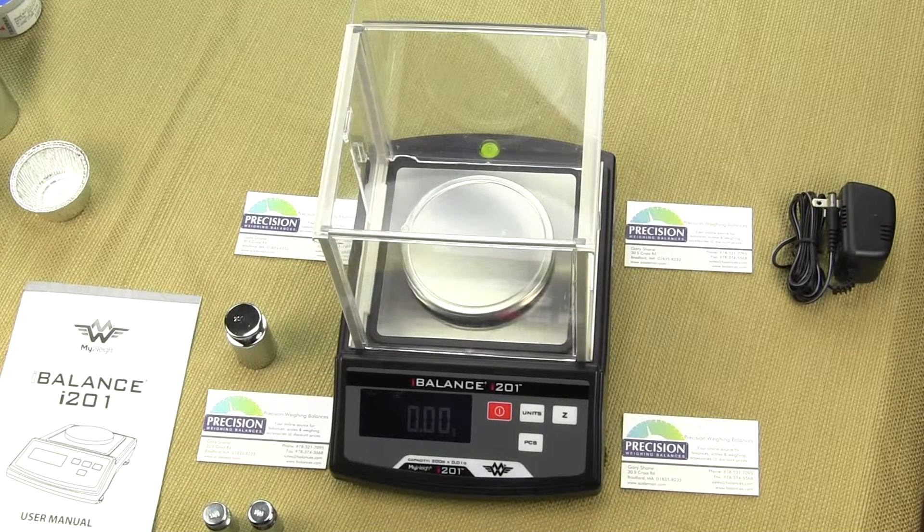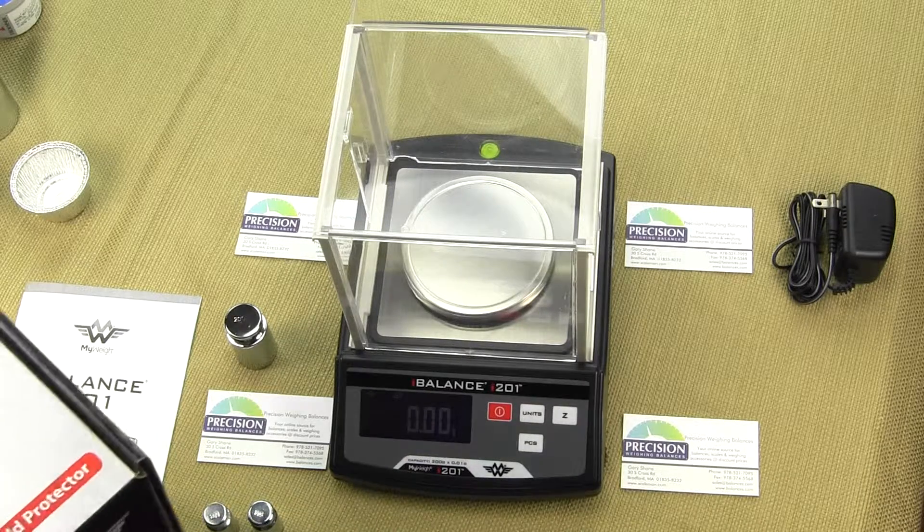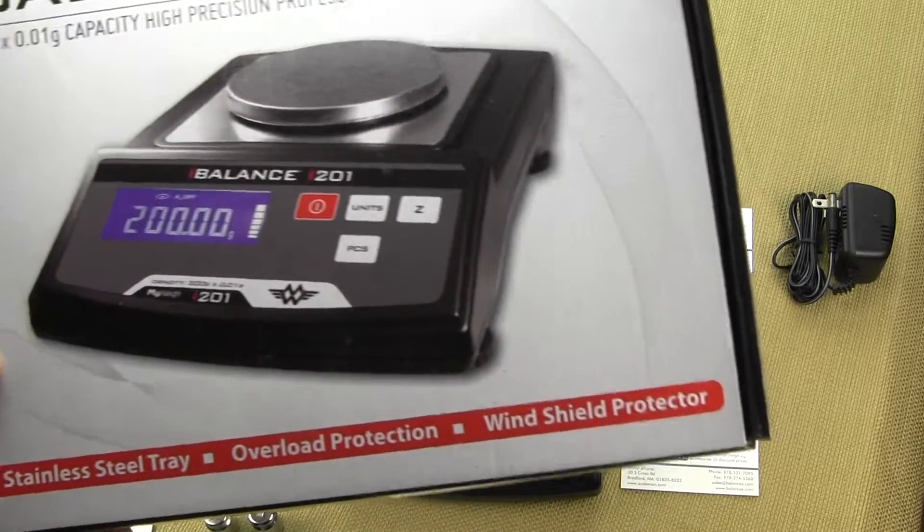This video is on the MyWeigh i-201 version 2. We are Precision Weighing Balances, an authorized MyWeigh dealer, and you can purchase the i-201 at balances.com.